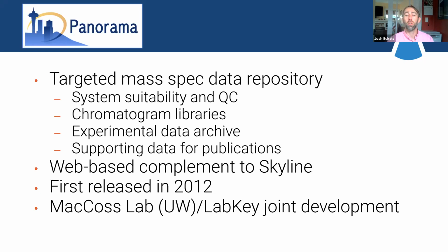Just being a general data archive, being able to search for a particular protein or peptide or small molecule across all the data that you've accumulated. So instead of having, say, thousands of files on a network file share with some perhaps convoluted directory structure, or maybe you've got a lot of data files that are on a postdoc's laptop that really could benefit from being more centralized, a little more durable to be reused in the lab after they leave.